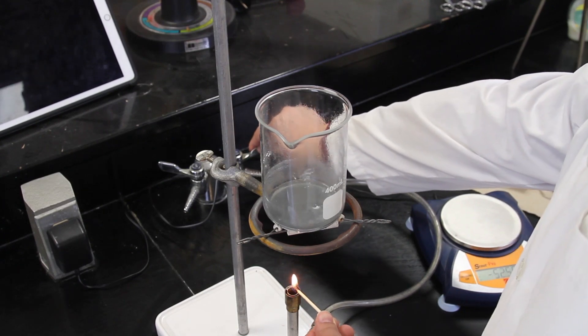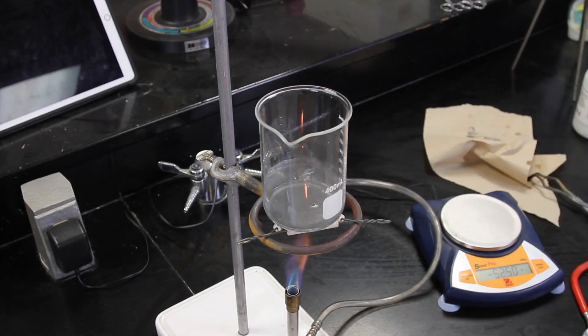If you do not have a hot plate, a Bunsen burner or torch can be used. This method is much faster but needs to be done with more care to avoid possibly splitting the coins.